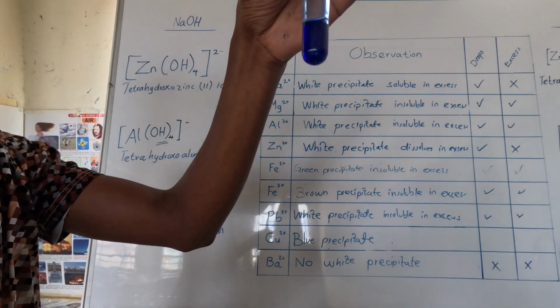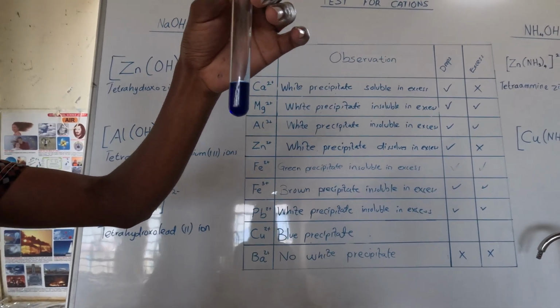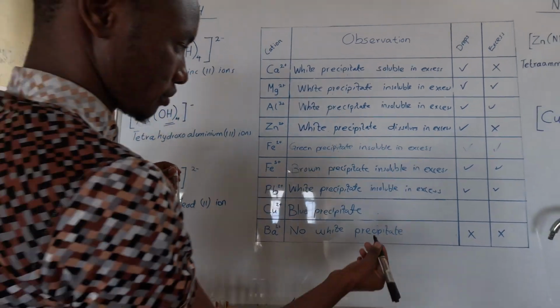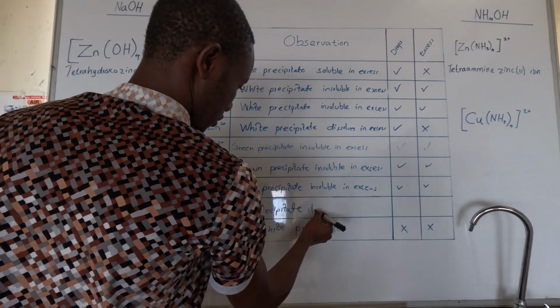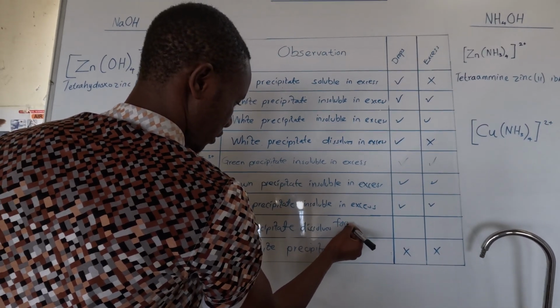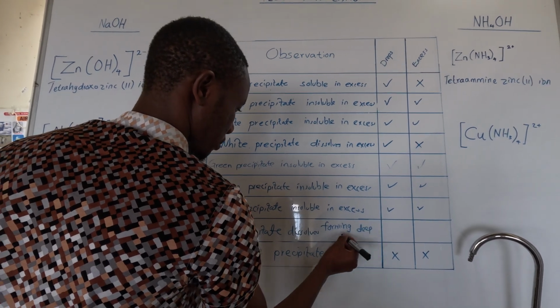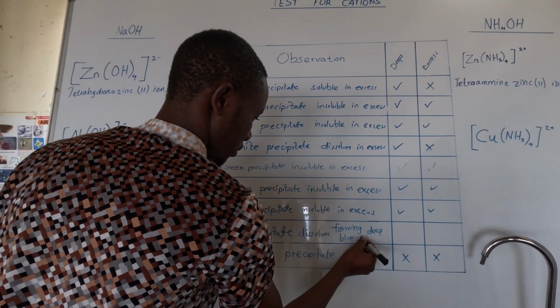It dissolves, forming a deep blue solution.